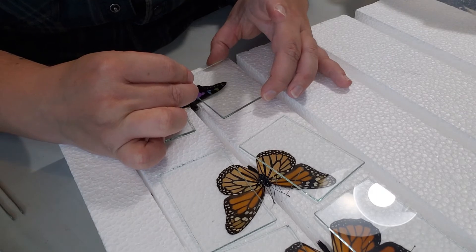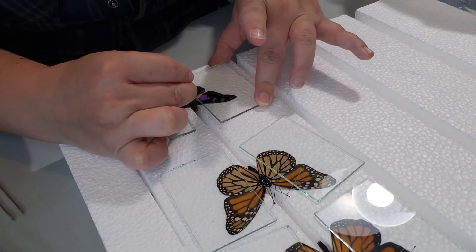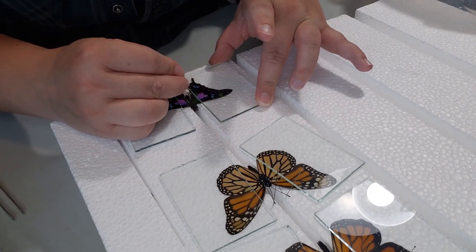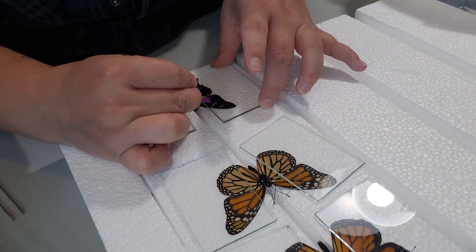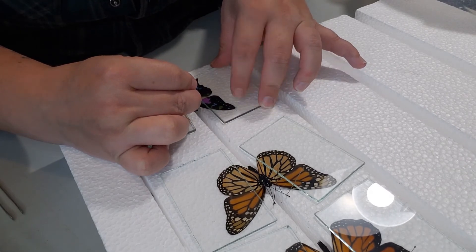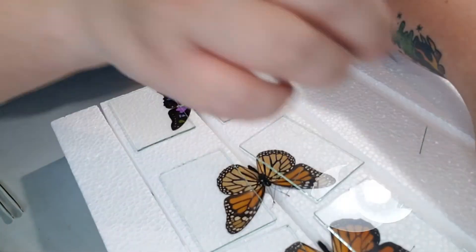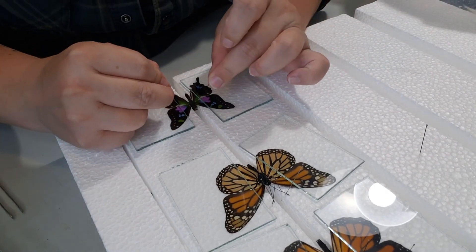Secure the body in place with pins so that it doesn't shift around as you're moving the wings. Then you're free to move those wings by slowly poking at the veins. I like to move the forewing up a little bit, then the hind wing up a little bit, going back and forth so the hind wing doesn't end up coming above the forewing.